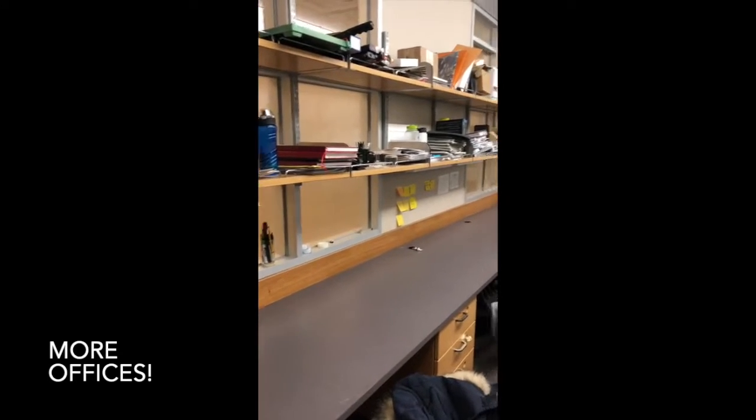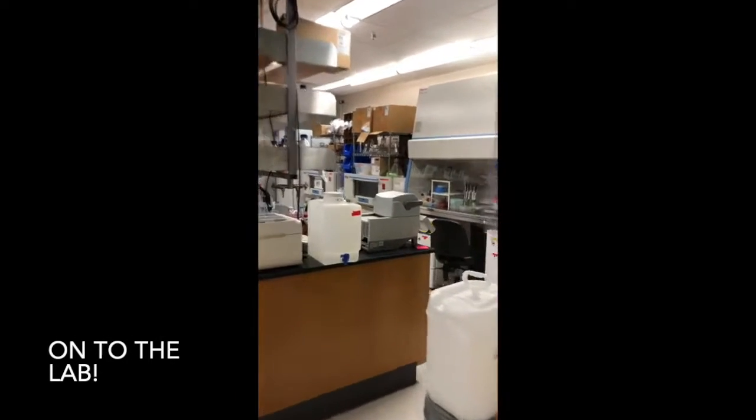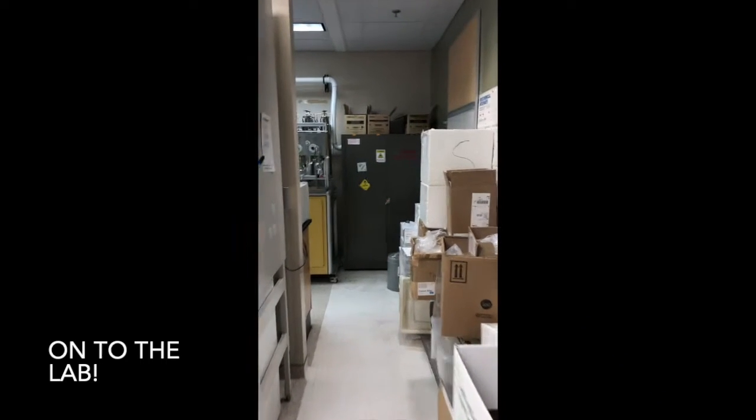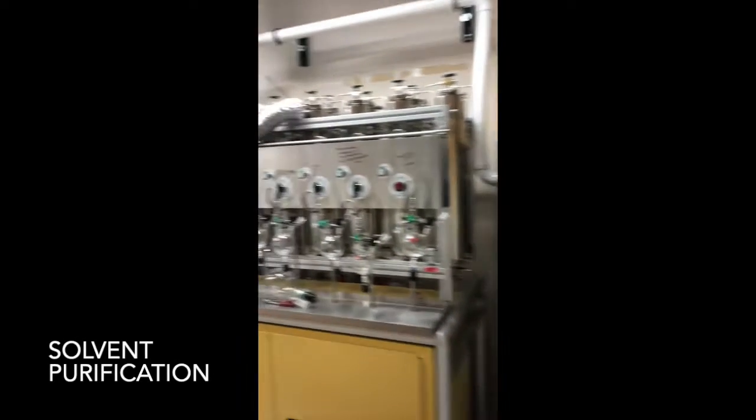Here's the larger office cluster where the majority of folks sit and then right behind that is where we enter the main labs. As we step into the lab a little further you can start to see some of the facilities that make things work on a day-to-day basis.